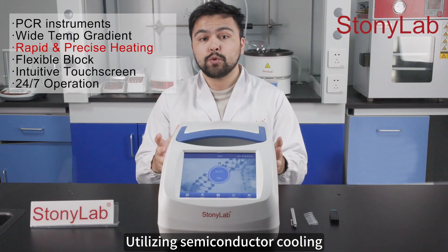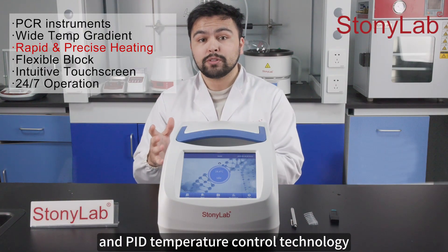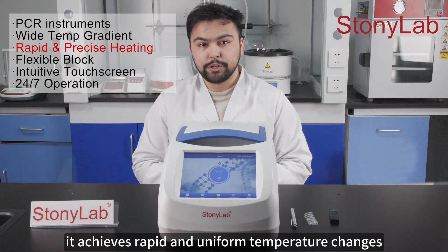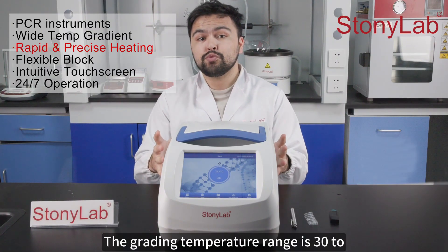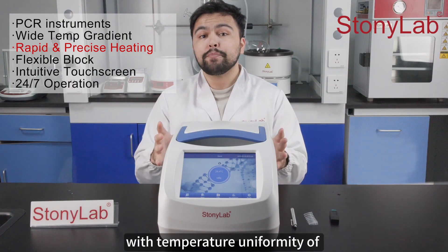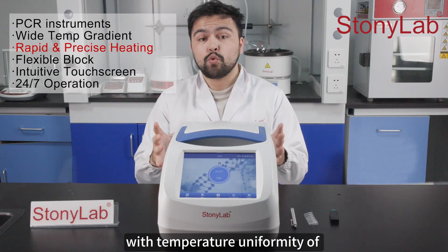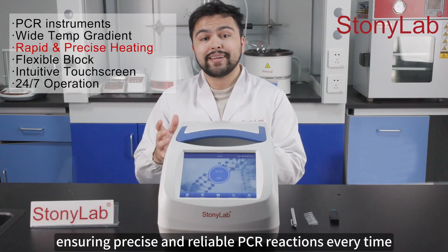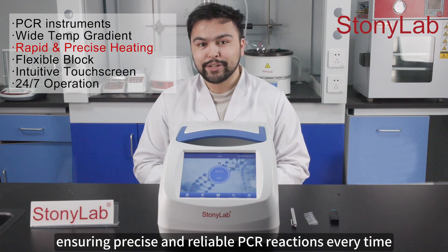Utilizing semiconductor cooling and PID temperature control technology, it achieves rapid and uniform temperature changes. The gradient temperature range is 30 to 105 degrees Celsius, with temperature uniformity of plus or minus 0.3 degrees Celsius, ensuring precise and reliable PCR reactions every time.